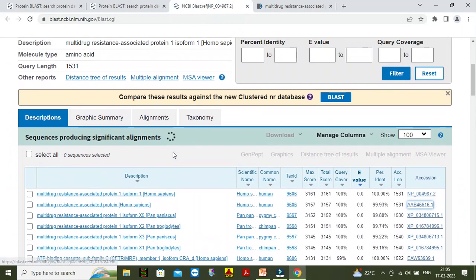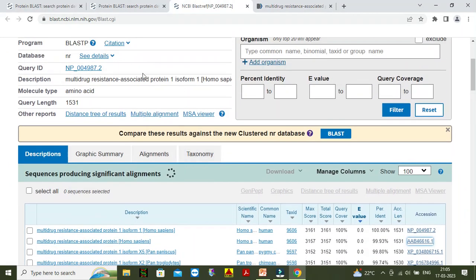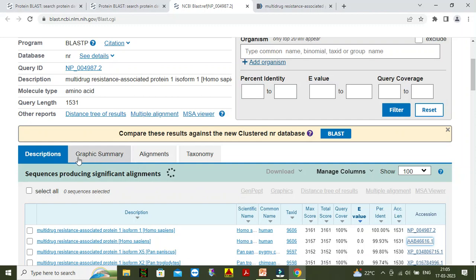The results can be summarized in the summary part: Description, Graphic Summary, Alignment, and Taxonomy. I have given details about the Graphic Summary in the previous lecture, so I will not go into the Graphic Summary in detail.